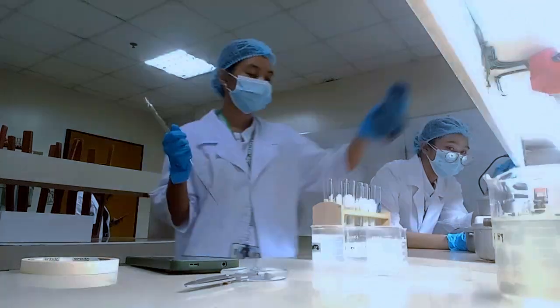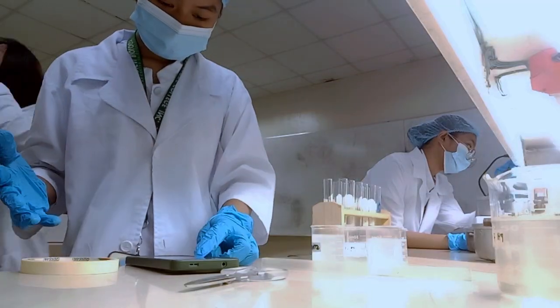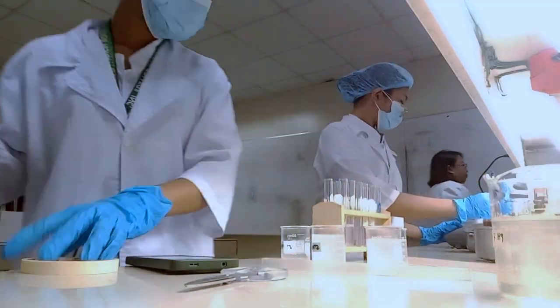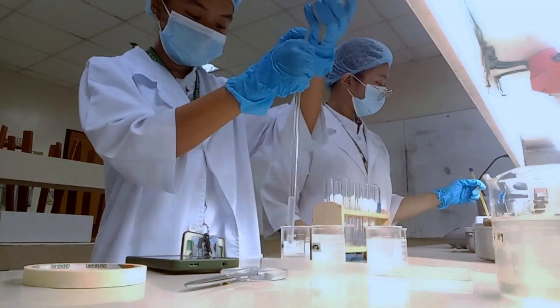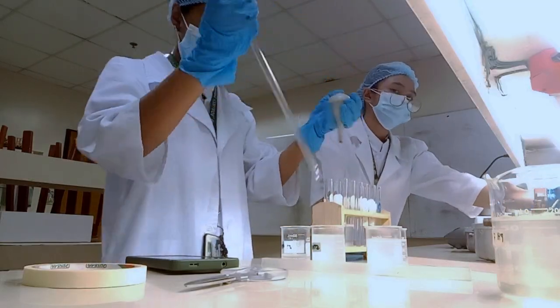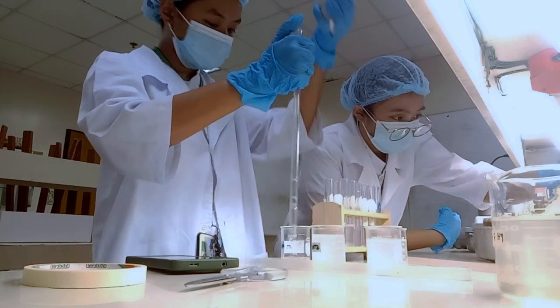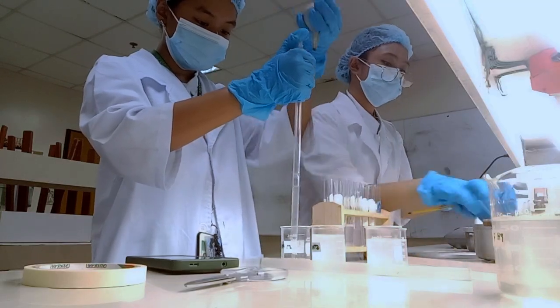This experiment demonstrates the importance of optimum conditions for enzyme activity. Salivary amylase functions best near neutral pH because the oral cavity normally maintains a pH close to 7. Under acidic conditions, such as in the stomach, the enzyme becomes less active, slowing starch digestion. At very high temperatures, enzymes undergo denaturation. This changes the three-dimensional structure of the enzyme and destroys the active site necessary for enzyme-substrate binding.